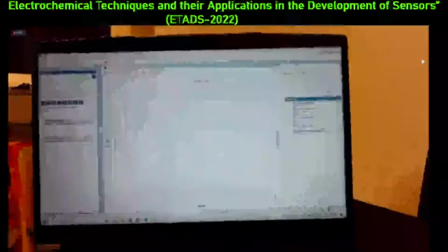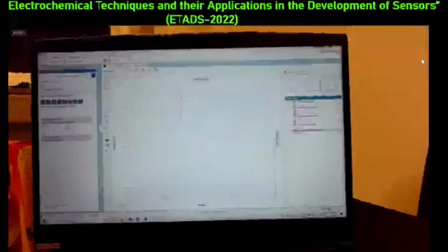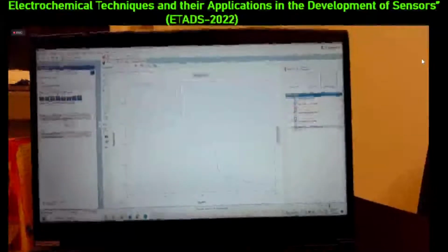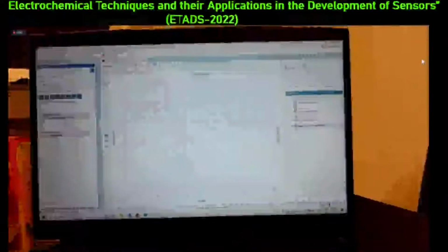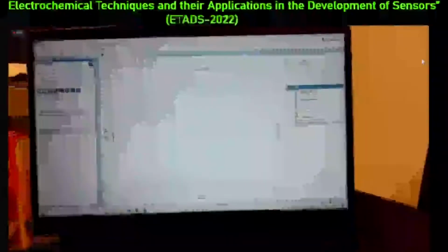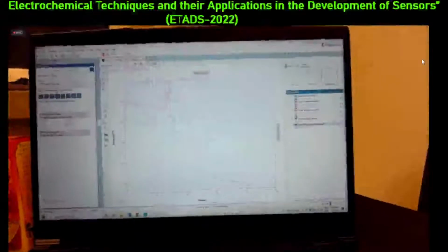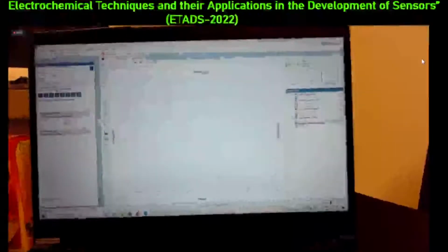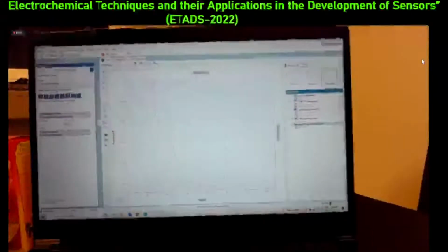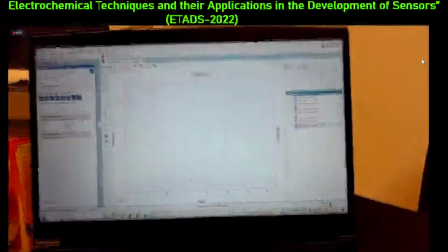I'm going to wait until 80 seconds. And then I will move it to pH 7 and then back to pH 5. So just bear with me until 80 seconds here. Here we go. I'm going to now move it. It will take some time to move towards a slightly more acidic solution. So there you go. So now I'm at pH 5 again.